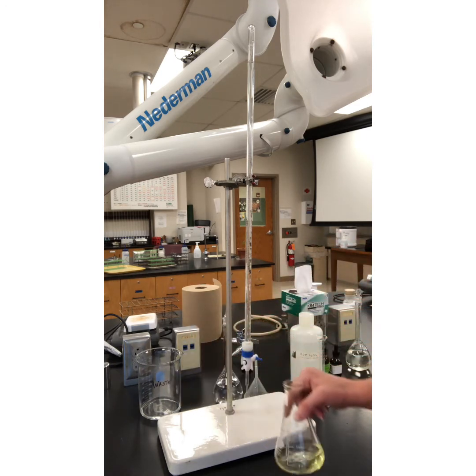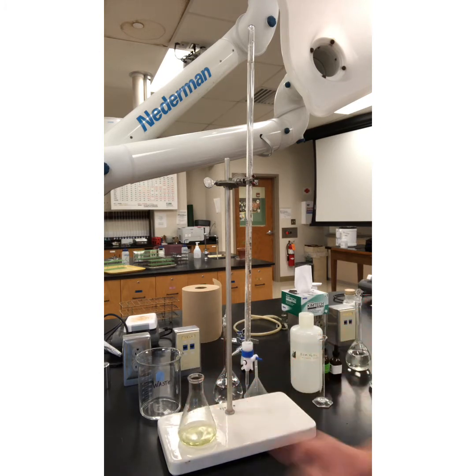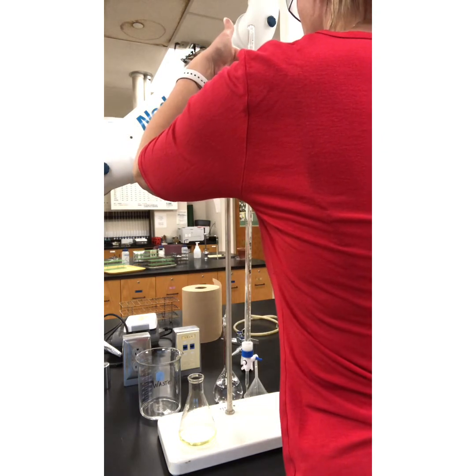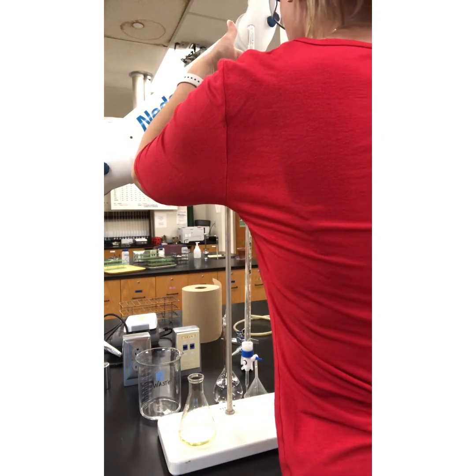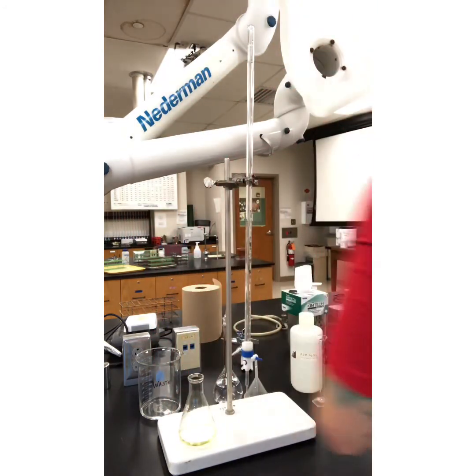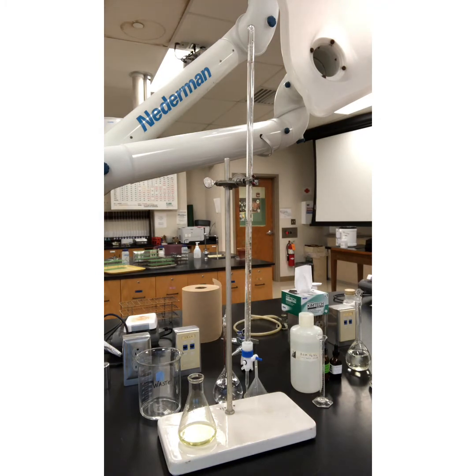All right, so let me note the starting point of my burette. So my V naught, my V initial, whichever you want to call it. V naught, V sub 0. That's what I like to call it sometimes. So V naught is 1.02 milliliters. What we're interested in is the delta V for each portion here. We're going to look at the change in volume for each one of these.